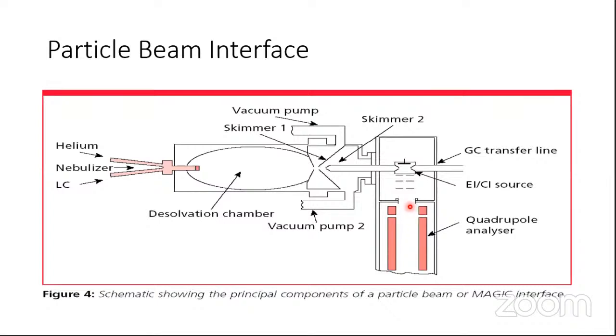Okay, so similar to thermospray, slightly different because of these kinds of skimmers or jets which are used here. Because of that, there is some restriction of the mobile phase which is getting generated in this area. It worked better, but again it is discontinued, because so much gas gets into the mass analyzer.